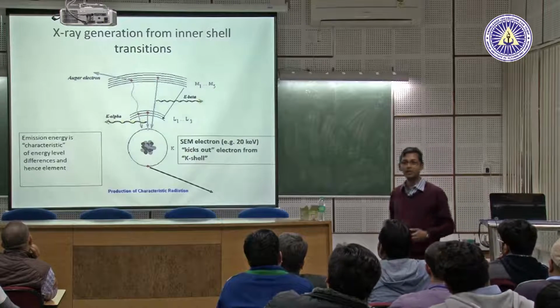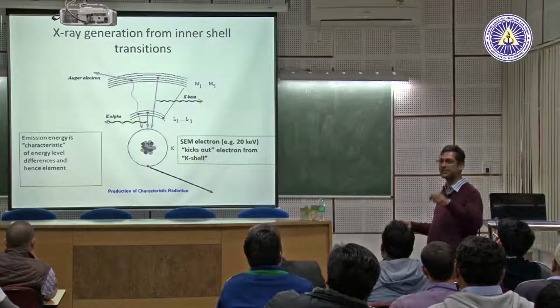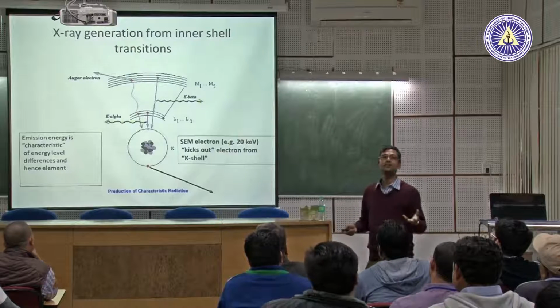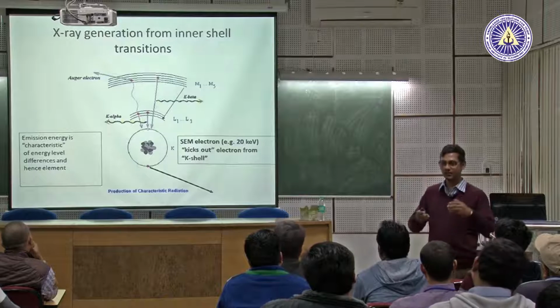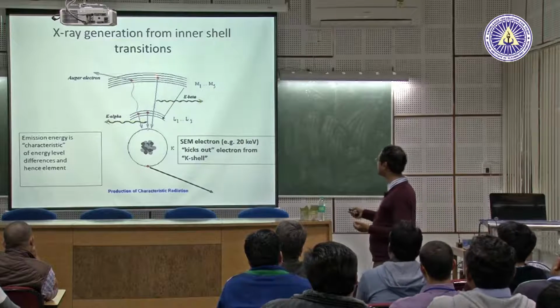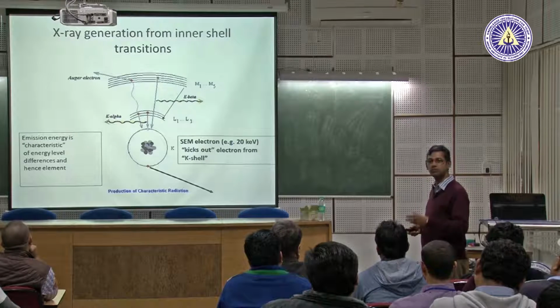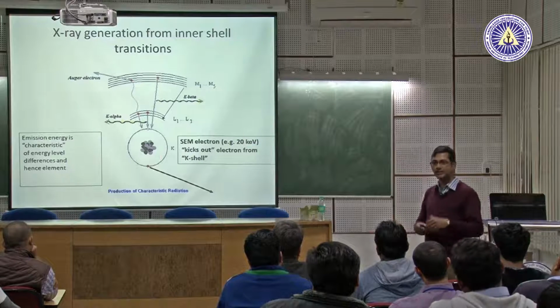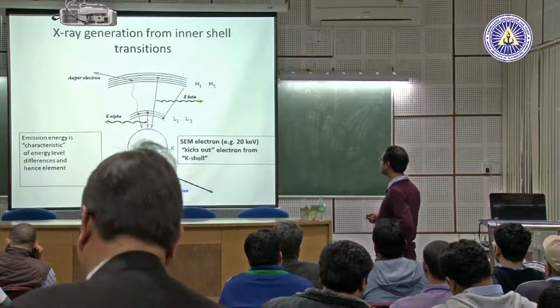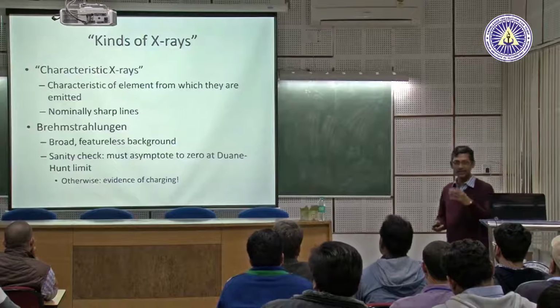I know that every atom has a definite structure, the electron levels and energies are fixed. So simply by measuring this X-ray energy, I can know which element is generating these X-rays. This is very routine stuff, right? Because I know the difference between these energy levels. Suppose, let us say, magnesium, you specifically know that, and this is not the same for magnesium, aluminum, silicon, and others. So by knowing the characteristic energy, I can detect the elements. That's the most important thing we do normally.